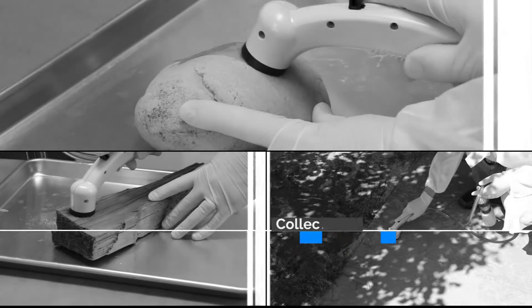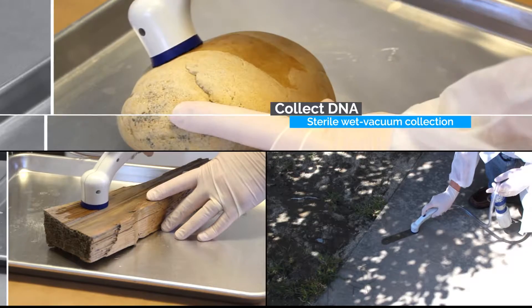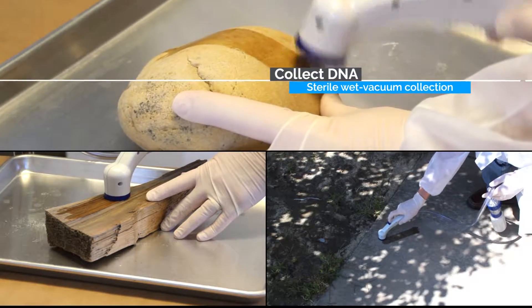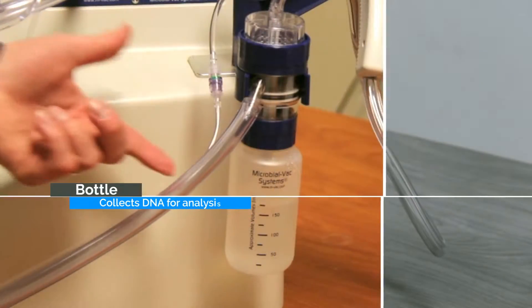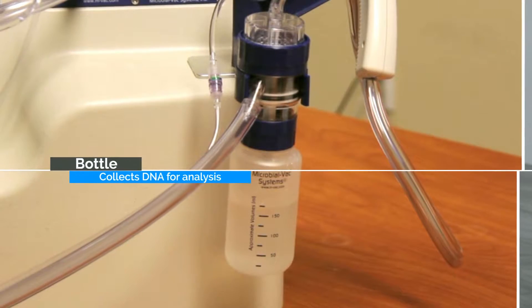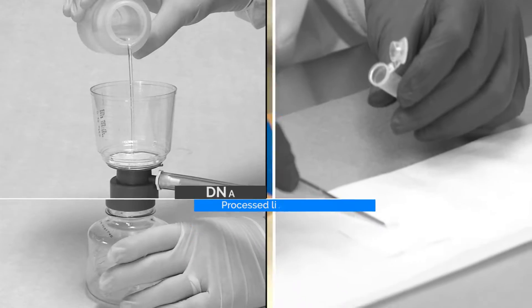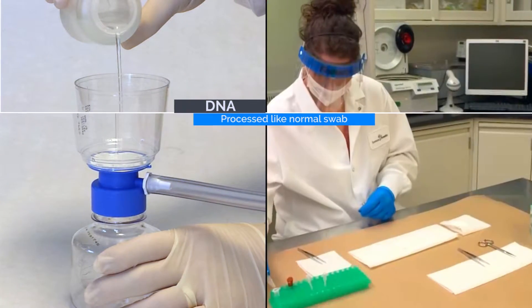The reason the MVAC is so effective is the combination it presents at the surface of the substrate where the DNA material was deposited. Through the combination of the sterile spray and the vacuum pressure, a mini-hurricane is produced at the surface, causing the DNA material that is there to be loosened and collected by the vacuum. Ultimately, the DNA material ends up in the collection bottle, which is then concentrated onto a PES filter. The filter is sent to the lab and processed, much like a swab.